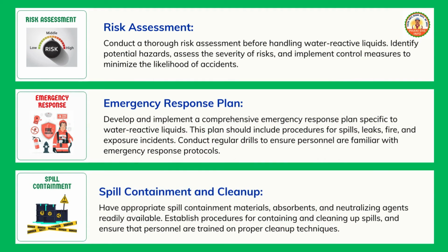Spill containment and cleanup. Have appropriate spill containment materials, absorbents, and neutralizing agents readily available. Establish procedures for containing and cleaning up spills, and ensure that personnel are trained on proper cleanup techniques.